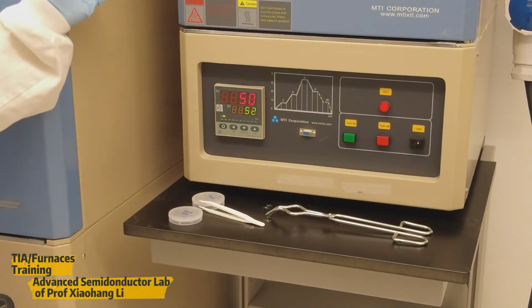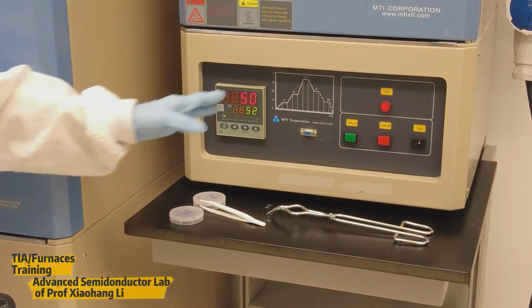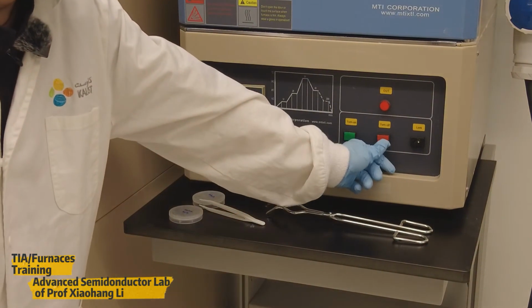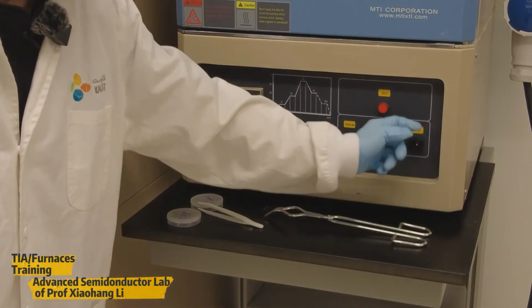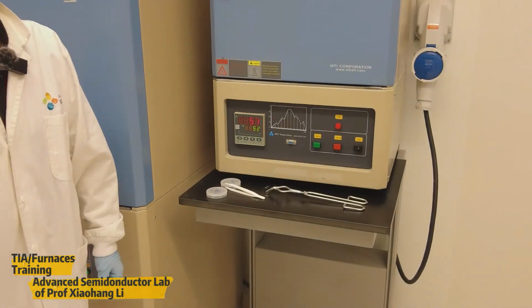Then the temperature will gradually go up to our setting and finish the program. After the whole program process is finished, you have to turn off the power and then switch off the lock. Then that's the process.